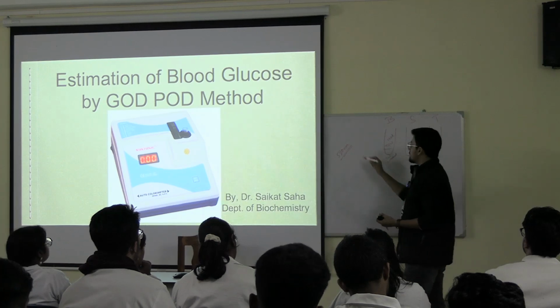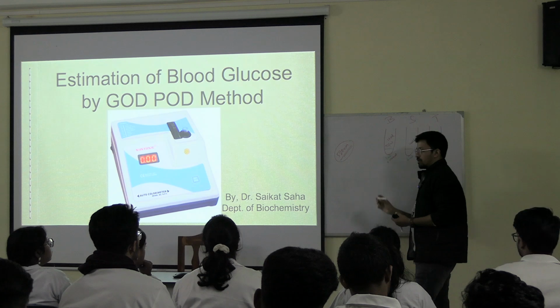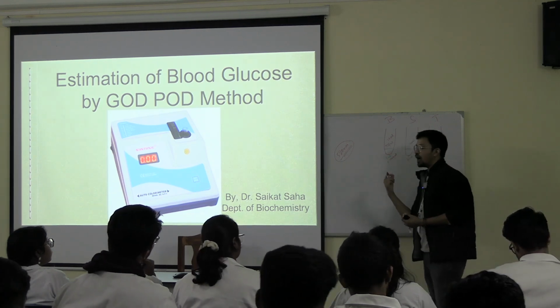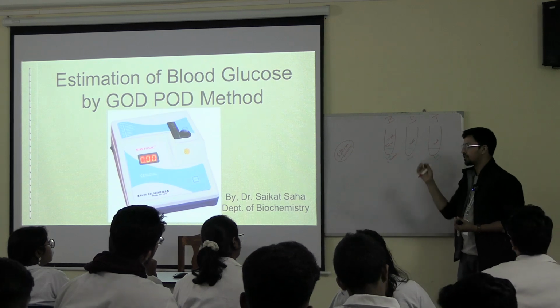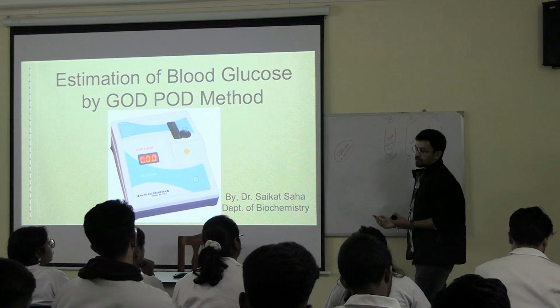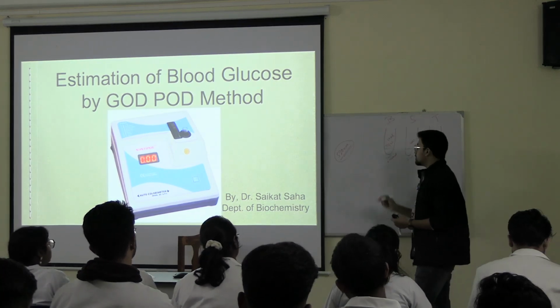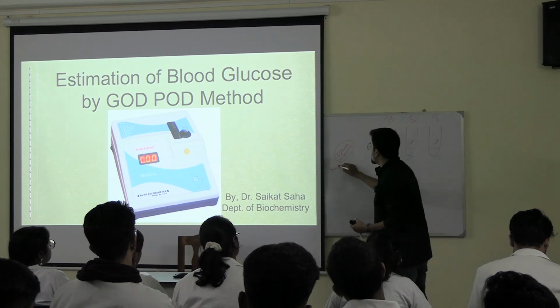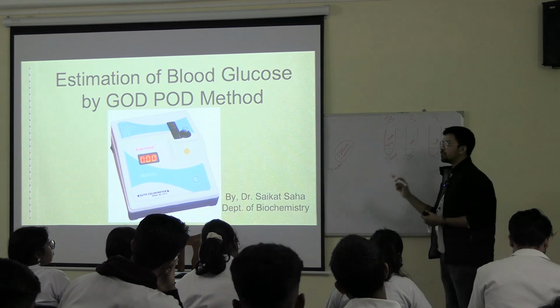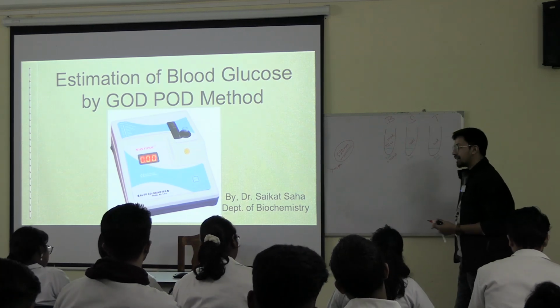No issues, but this is already given. In the manufacturer's instructions for use, this is already written as well, like in which wavelength you will get the maximum absorbance. That is your lambda max. You got already lambda max. So what we will do in the colorimeter, we will fix the wavelength to 520 nanometer, also known as a green filter. We have to use the green filter.